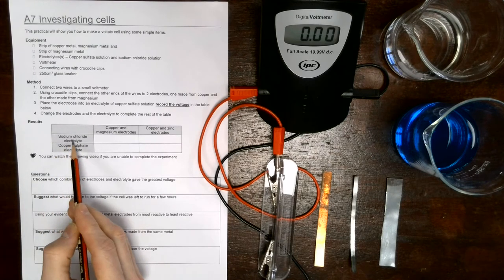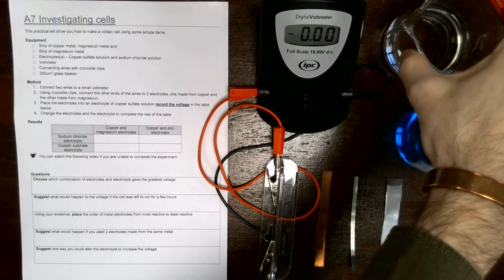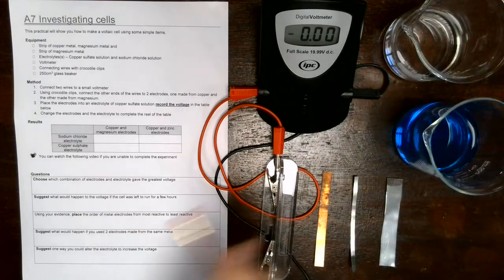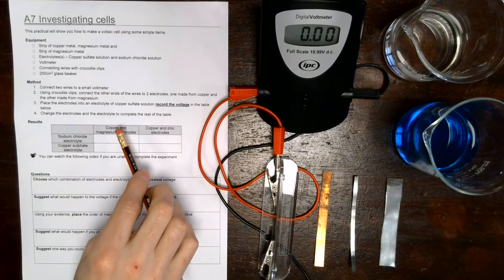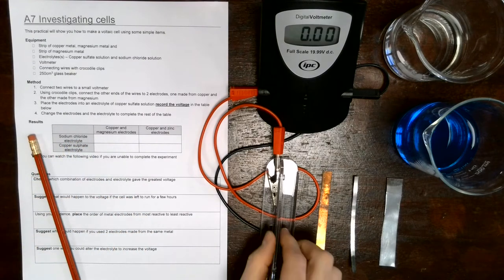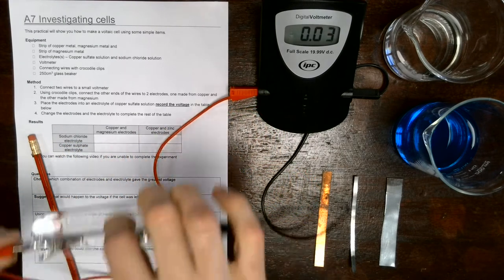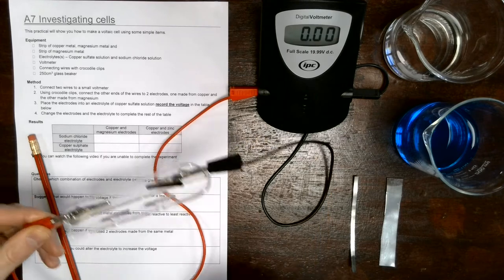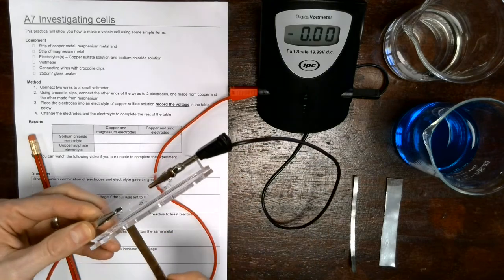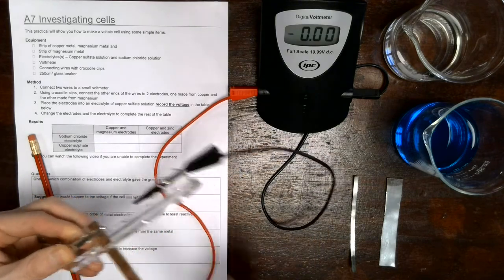The first electrolyte is going to be sodium chloride, so that's this beaker over here with the colorless solution, and we're going to be using copper and magnesium for our electrodes. So let's just get this set up. We're going to take the copper strip and place it into the crocodile clip. I'll hold it in place.